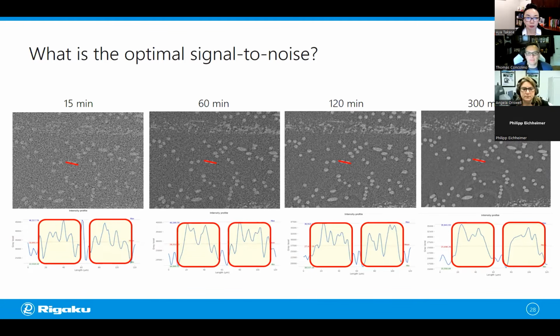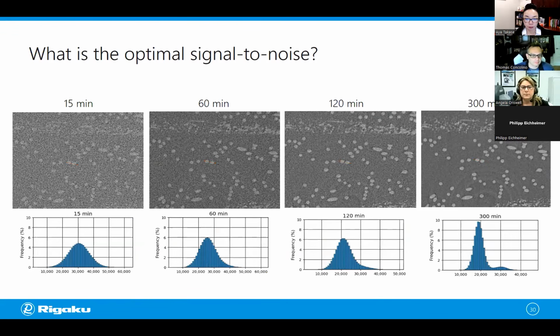Okay. And then one more question. This is actually based on, I believe it's slide 30, where you talked about improving longer data with signal to noise, right? So the question is, is it faster to use machine learning, deep learning versus just collecting longer data to improve segmentation? Are they catching up? Is the computer catching up to the actual data time?